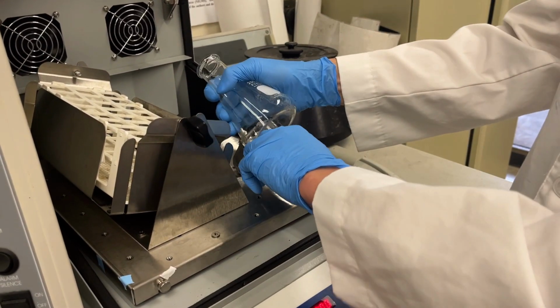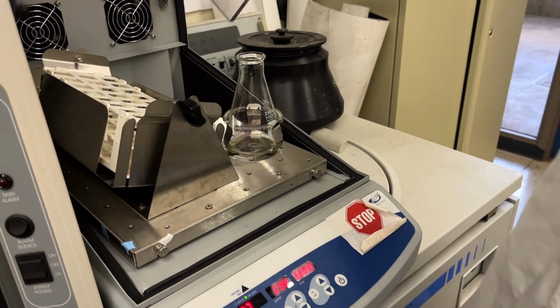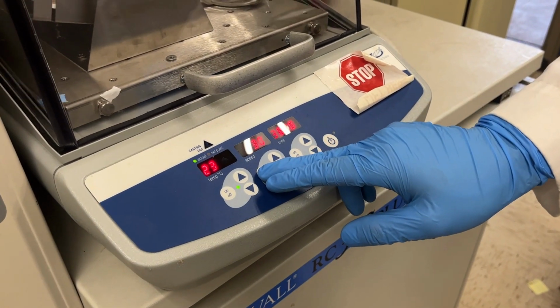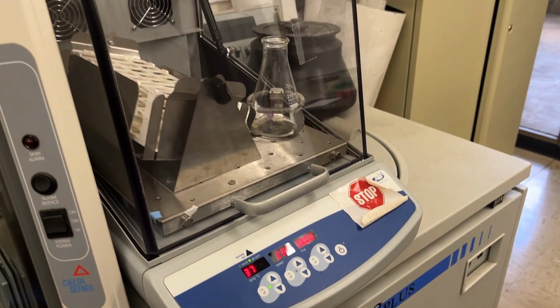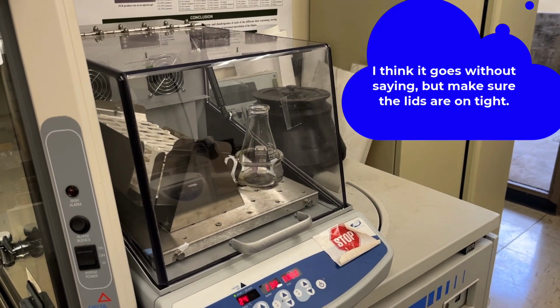Place your flask. It's a lot harder than Jaden makes it look. Into the holder. Close it and then give it some shaking. And so we're just going to simply let this shake for about an hour. And then that'll allow the cells some time to recover. It's going to start slow, but it'll get there.